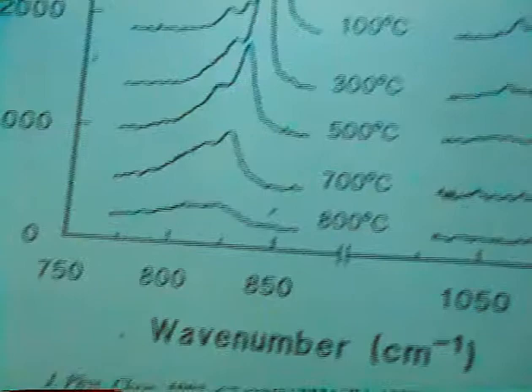Now, in the XPS experiments, of course, it was necessary to cool the sample and to measure the presence of peroxide ions at ambient conditions, room temperature, and under the vacuum of the XPS instrument, which obviously are conditions very far from the catalytic experiment. Nevertheless, with respect to loading of the barium in the magnesium oxide, there was good agreement between the presence of the peroxide ion and the catalytic activity of the material. And so we wanted to address such questions as, does the peroxide ion on barium magnesium oxide exist at temperatures approaching those used in the catalytic system?